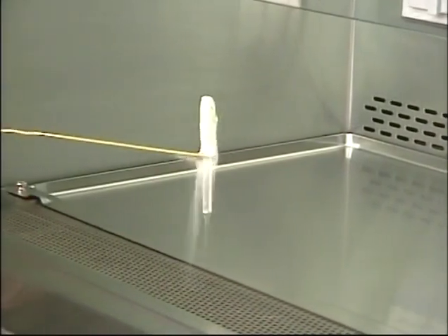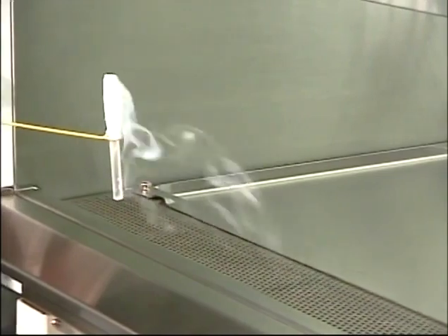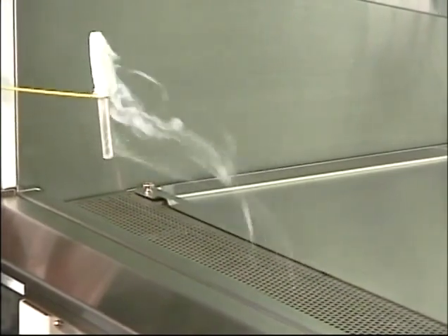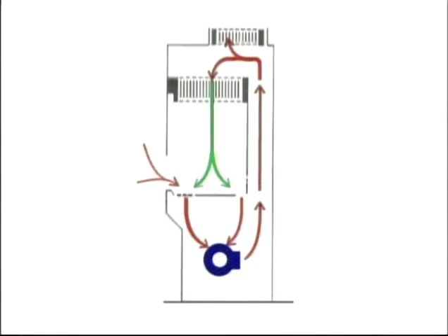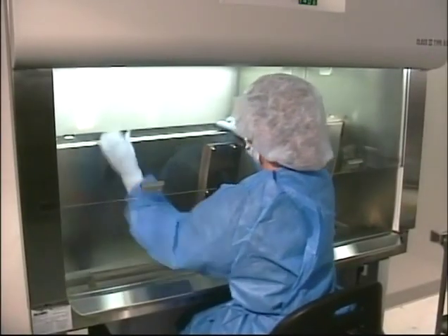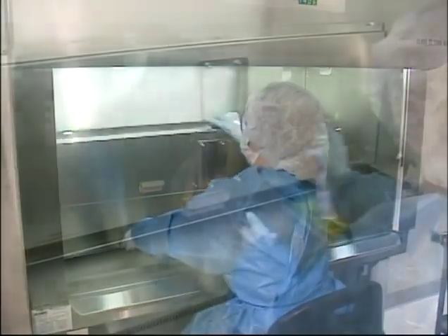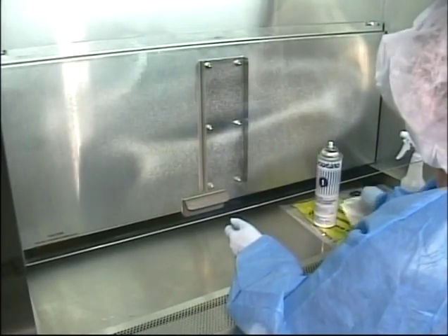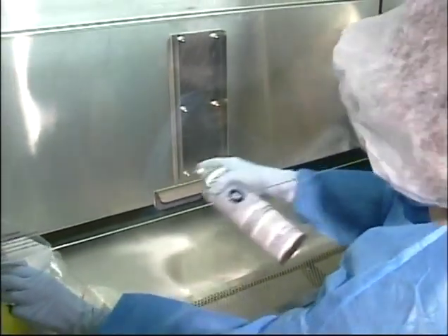Both makeup air and the forward-flowing supply air pass downward through the front grille and under the work tray before returning to the rear chase to the air handler. The under tray area can be expected to be contaminated with both hazardous materials and atmospheric contaminants. This area must be kept clean by thorough, routine sanitizing at the beginning and completion of each shift, and immediately whenever spills occur.